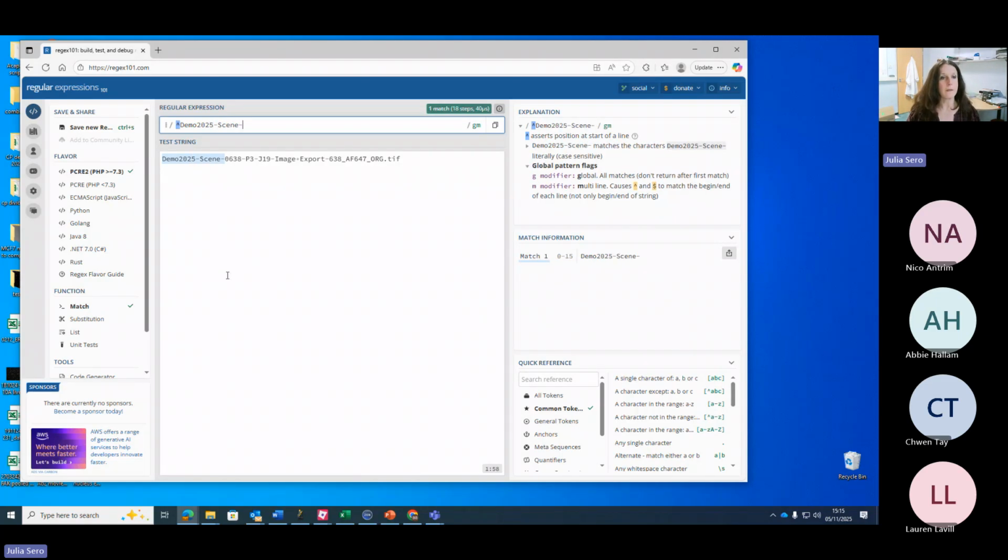Okay, so it's getting highlighted here in blue. So this is saying match a string, test string. In this context, a string is characters, so letters, numbers, special characters that are not a command. So we're just saying, yep, scan along, read all of this, the text that literally matches these letters and numbers.